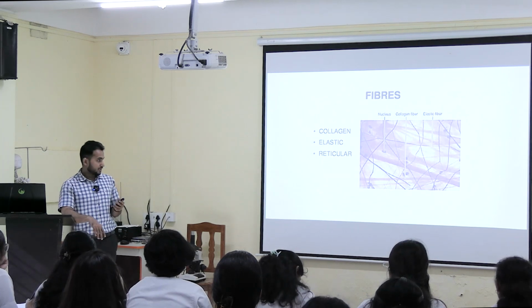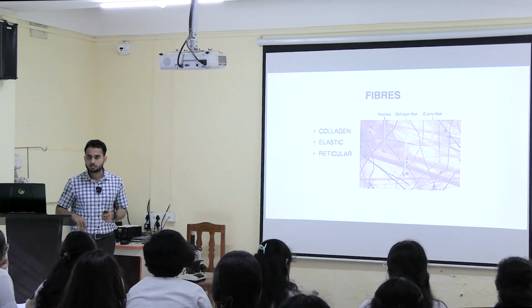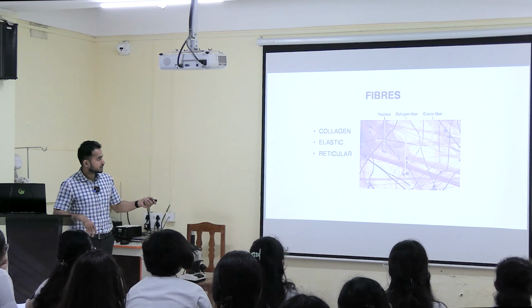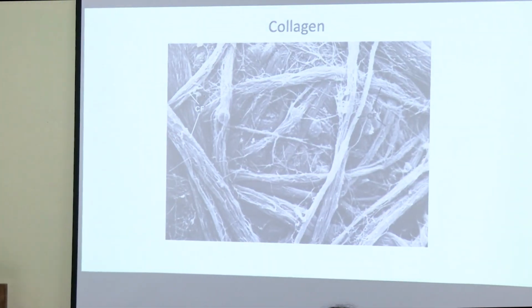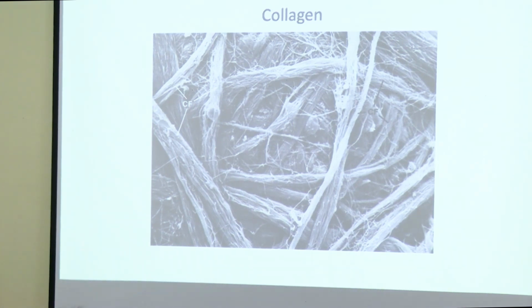So I have an image of collagen fibers under the electron microscope. Here you can see the collagen fiber. This is the collagen fiber. This is the collagen fiber. Now see the appearance. This is the electron microscope image of collagen fibers. See the difference.